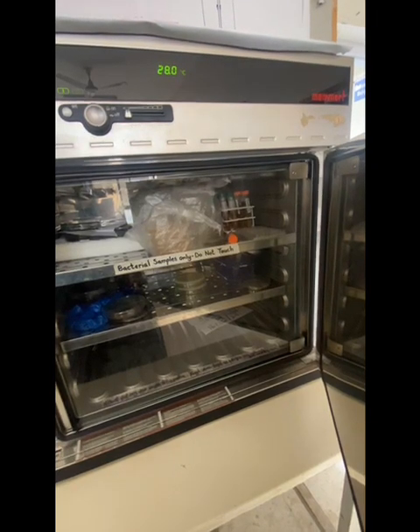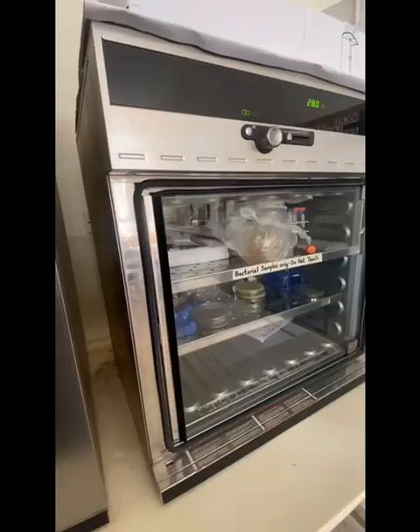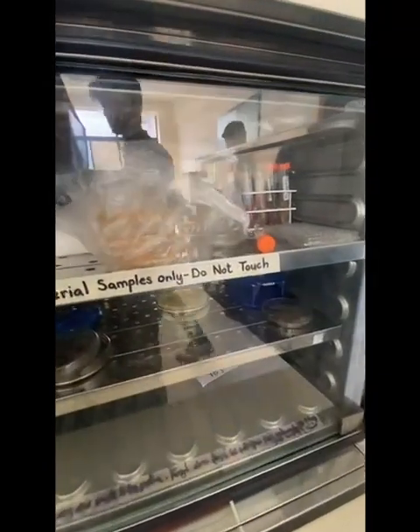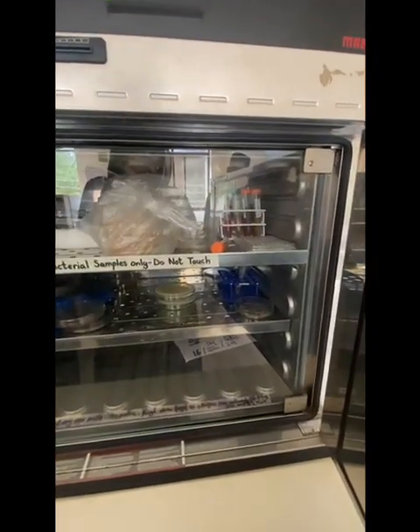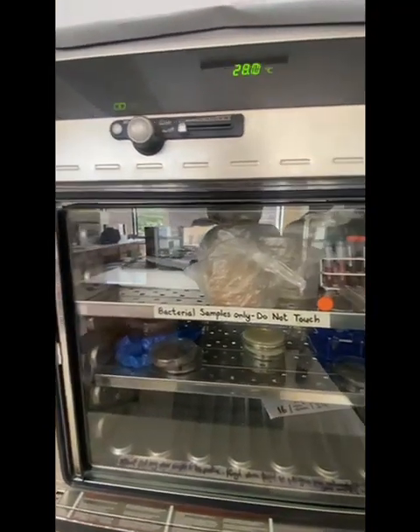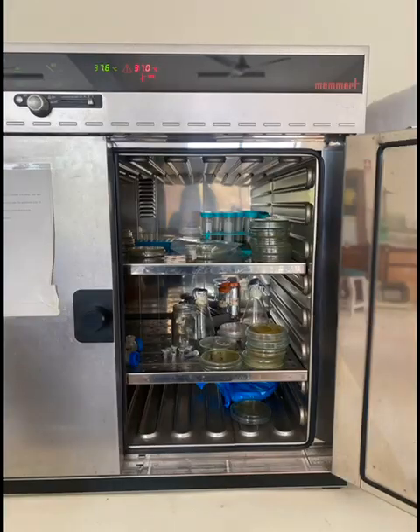Some incubators provide the option to control the atmospheric composition within the chamber, particularly the concentration of gases such as CO2 and oxygen. This feature is crucial for culturing cells that require specific gas concentrations for growth, such as mammalian cells or anaerobic microorganisms. To prevent contamination of cultures, growth incubators are equipped with sterilization features such as high temperature sterilization cycles or UV irradiation. These processes help maintain a sterile environment within the chamber.